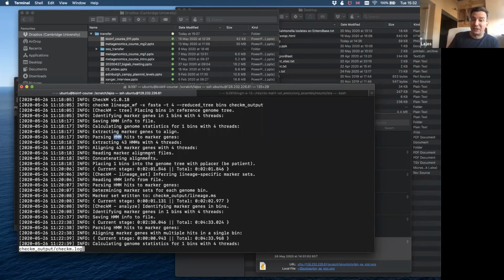How can it be that you have one colony, you are sequencing it, you are assembling it, and then a known single copy gene is found in multiple copies? The reason most of the time is that your culturing wasn't pure enough.